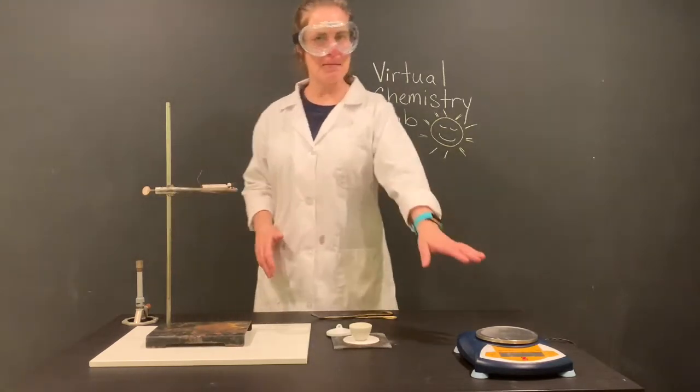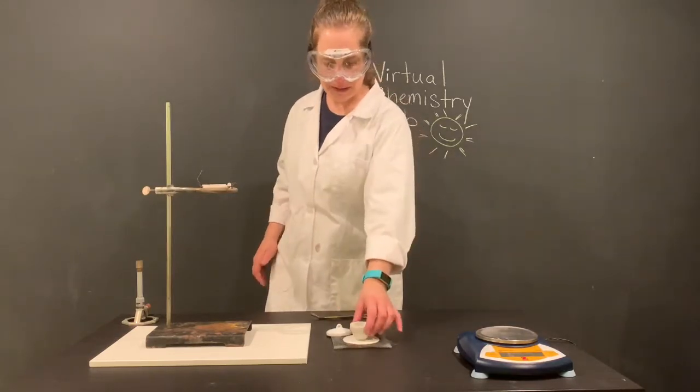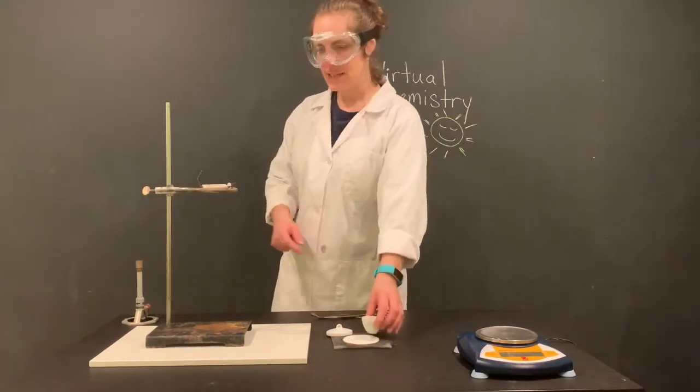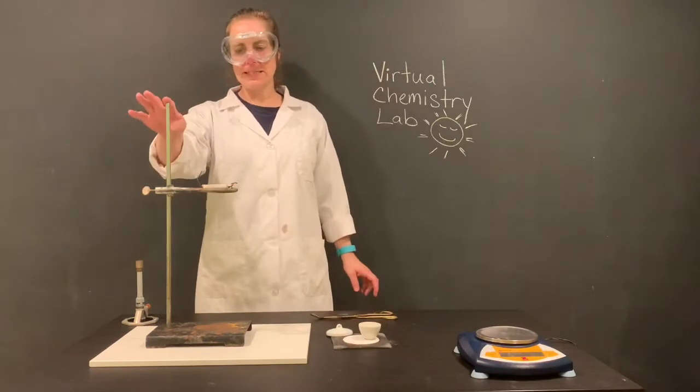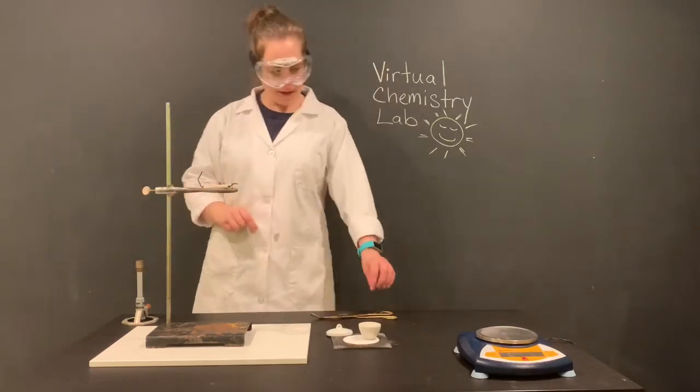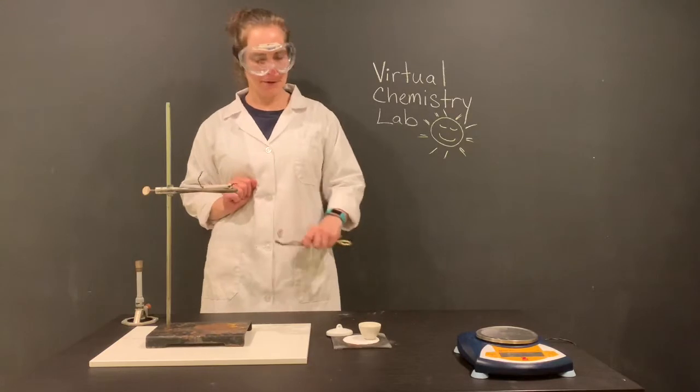You see here I've got my electronic balance, I've got my crucible and top, a wire gauze, I've got my ring stand, my ring, my clay triangle, a pair of crucible tongs, and my trusty Bunsen burner.